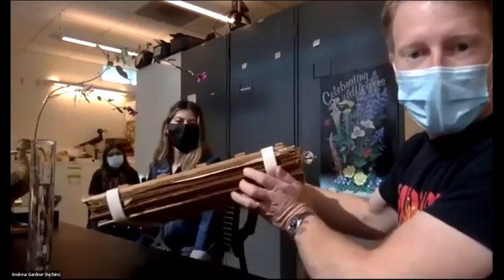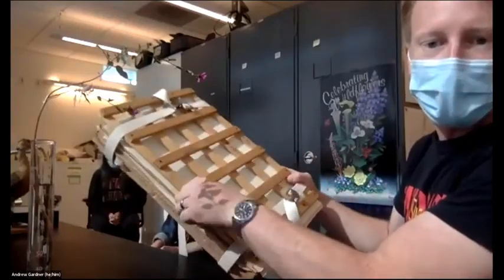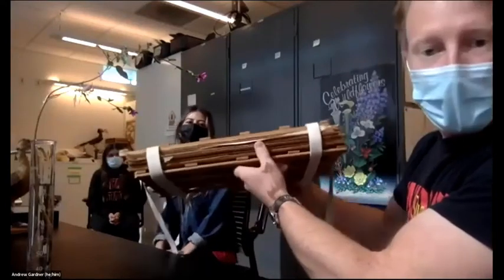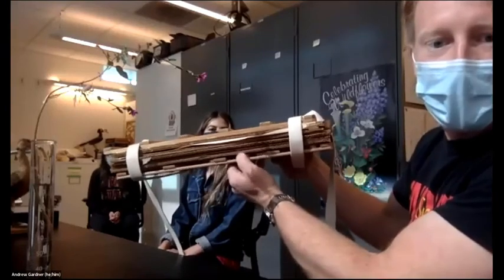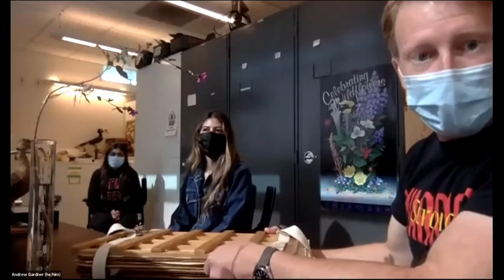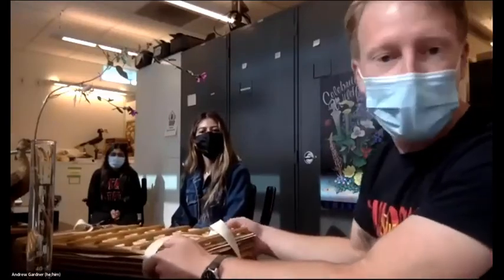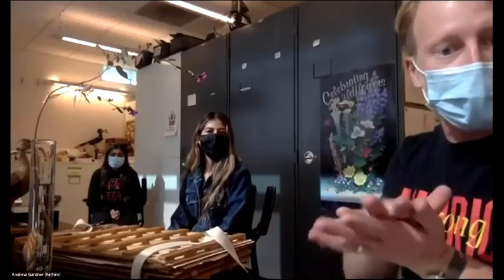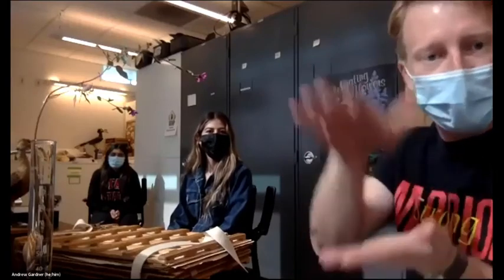Plant presses are made of basically 2 kind of hard boards. This one's kind of fancy to allow greater airflow. In addition to that, most plant presses use cardboard, like that hard corrugated cardboard on the inside. And then the plants themselves are pressed between paper. At home, if you want to make a plant press, you can simply use a couple of books with paper like newspaper or something like that, and the weight of the books on top of your plant will smash it down.